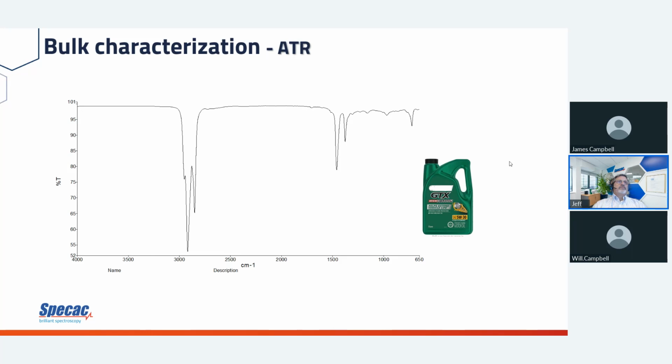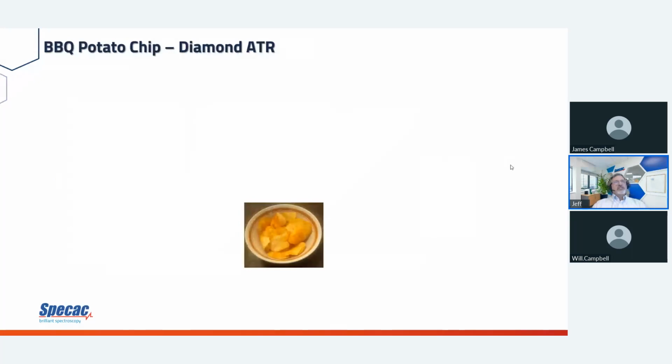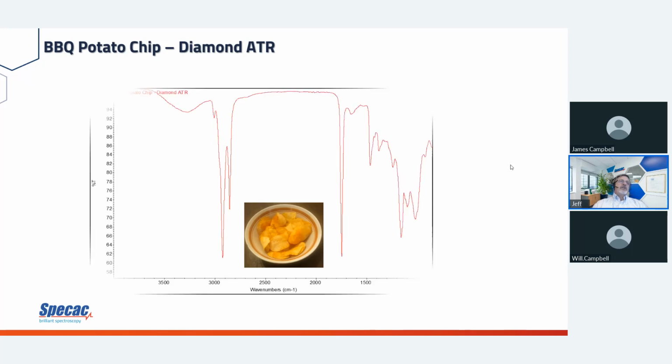Anybody hungry, and have something to eat at lunchtime, and you just so happen to have potato chips, and they just happen to be barbecue potato chips? I had that one day, sitting there eating potato chips. I said, this could be pretty neat to take a look at. I just took it, put it on the ATR, put the pressure device down on it, hit scan, and I thought it was pretty cool. I didn't go any further than that. I didn't bother to analyze it, looking for the oils and everything else that's in there. But I thought it was just pretty cool.